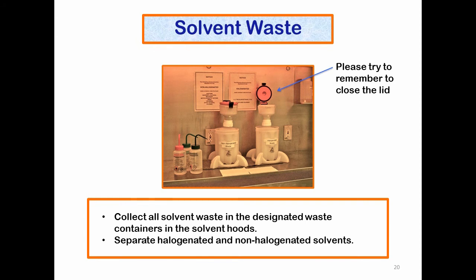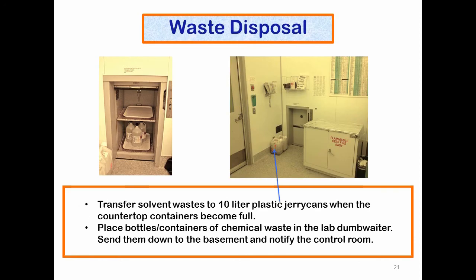Solvent waste, please remember to close the lid when you do administer solvent waste into the solvent waste container. Collect all solvent waste in the designated containers in the solvent hoods, and separate out the halogenated versus non-halogenated solvents, remembering that halogens are chlorine, fluorine, etc.